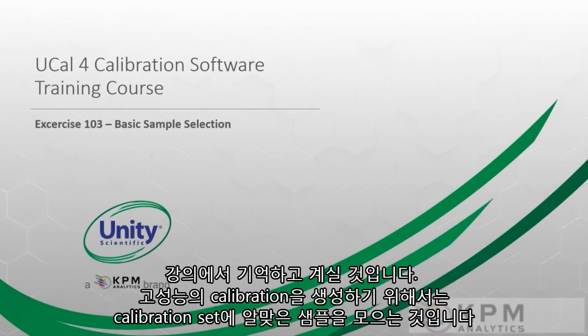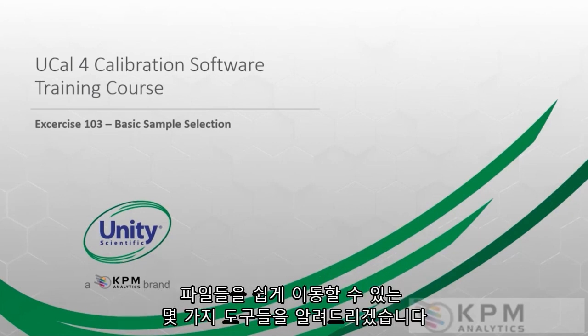If you remember in the lecture, I was saying one of the real keys to creating a robust and a high performance calibration is getting the right samples in your calibration set. So we're teaching you some of the tools that allow you to move in and out of these files really easily.